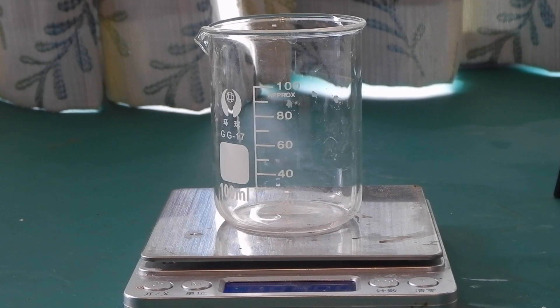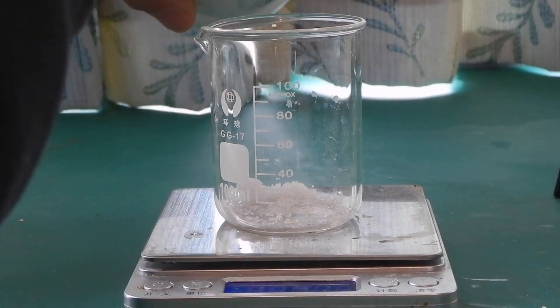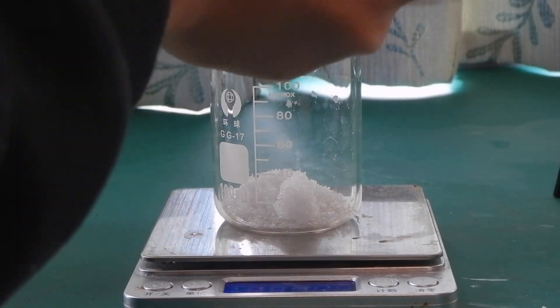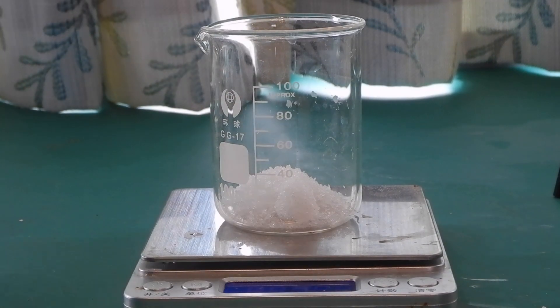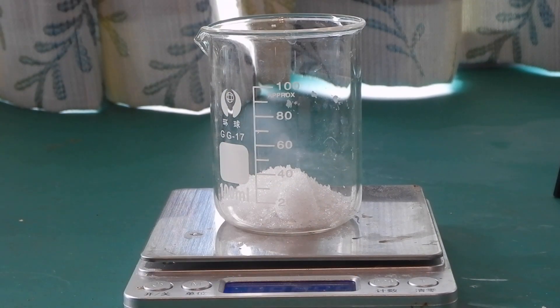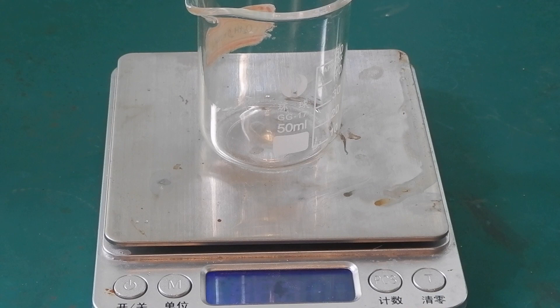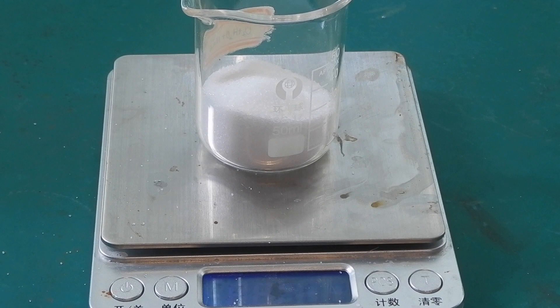Measure out 69.04 grams of sodium bisulfate monohydrate in a beaker and add 63 milliliters of water to dissolve it. Then, measure out 29.22 grams of sodium chloride in another beaker. Dump the sodium chloride into the conical flask.